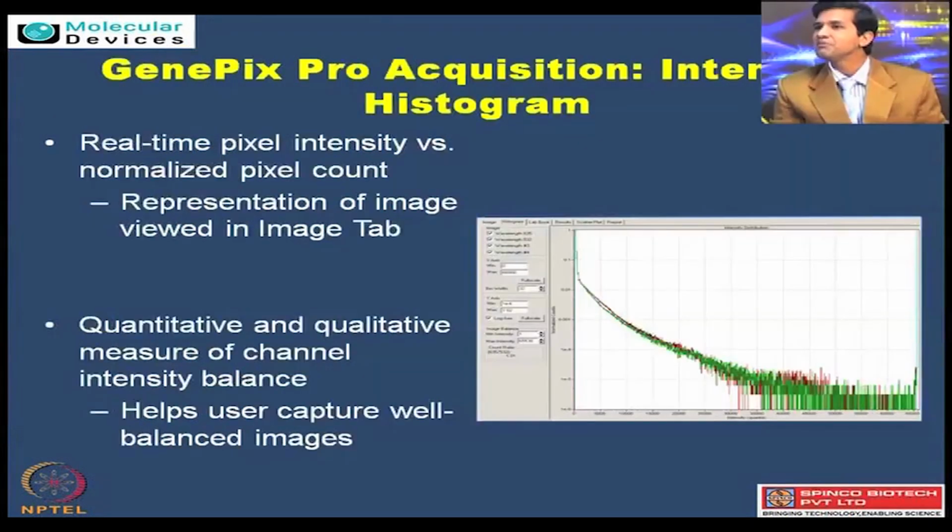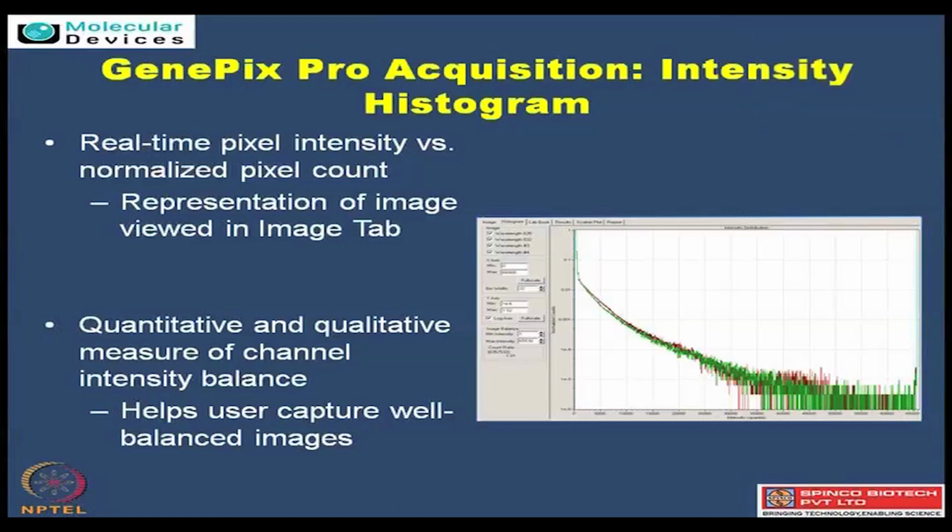So basically, in the preview scan, when you are scanning your live data, you can switch to the histogram graph. What it gives is how much the red and green channels are contributing towards the intensities. You really want them to overlap, so that they are balanced. There could be a small variability in the beginning, owing to the background and then the spots coming in.